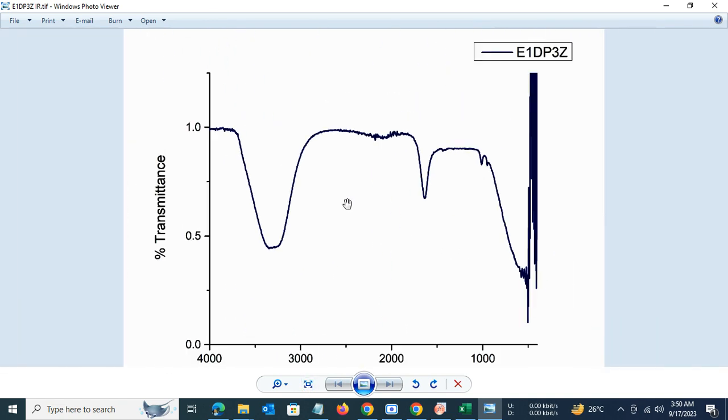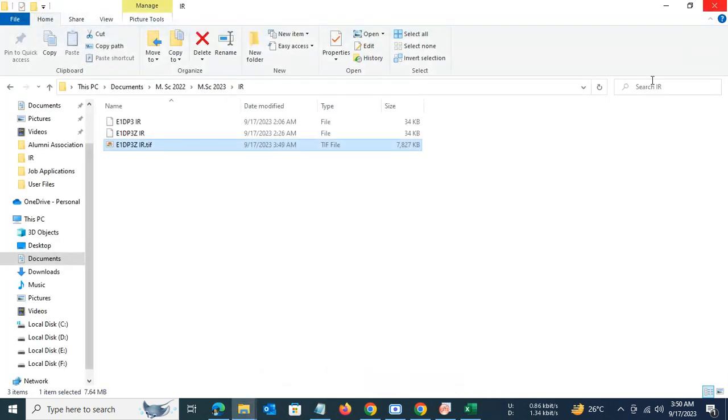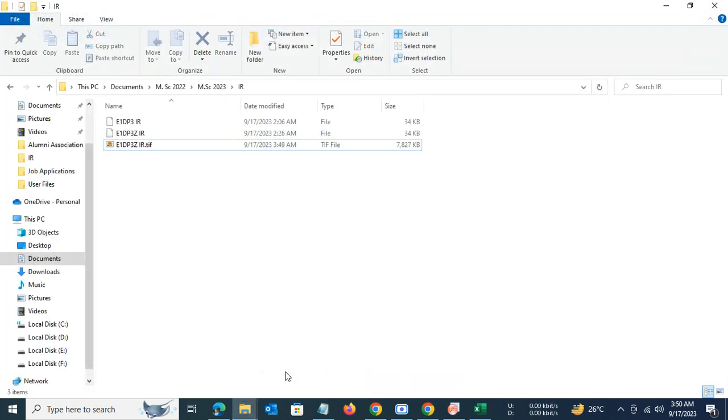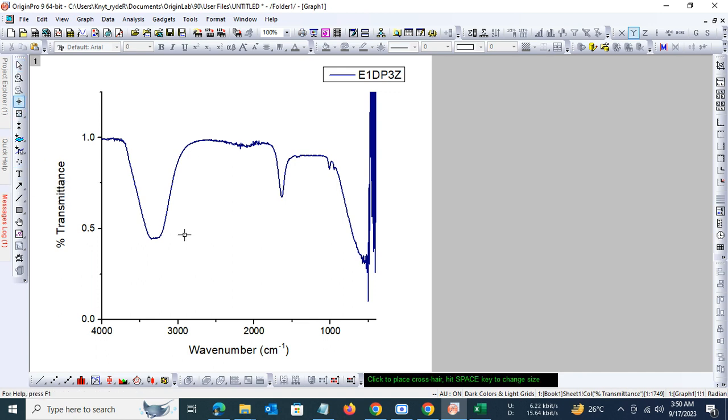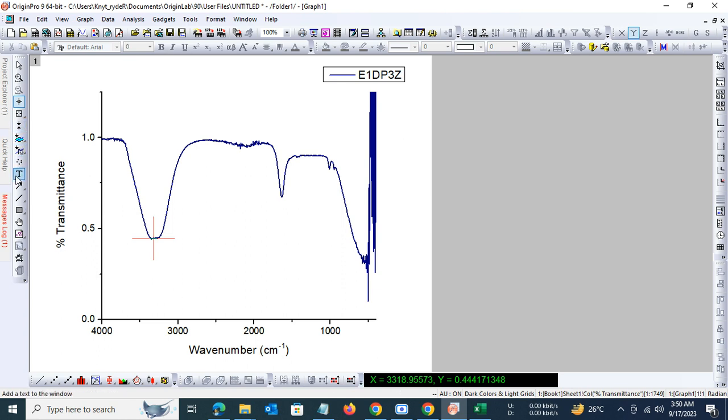The labeling of individual peaks can also be done, and there is a very simple process. Let's say you want to label a particular peak, let's say this one, 3318. Use the text function here and put it as 3318.